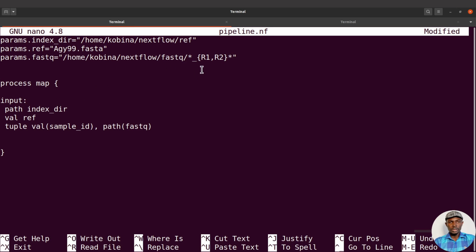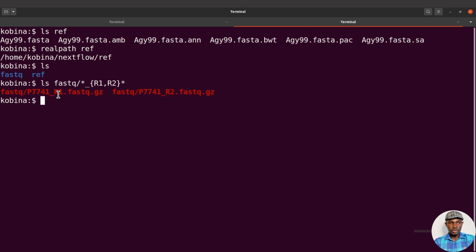All right, so we have our pattern. Everything before this, Nextflow tells us, is a sample name. So that's why we have this here. This is what will be given to us. So we have our paired end data, and then this becomes our sample name.